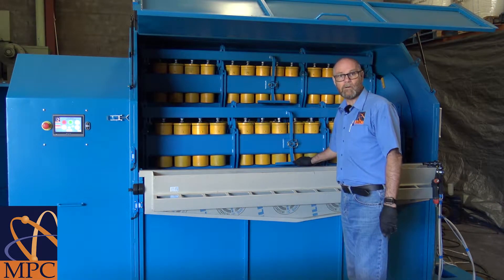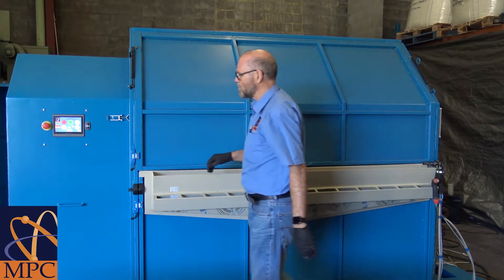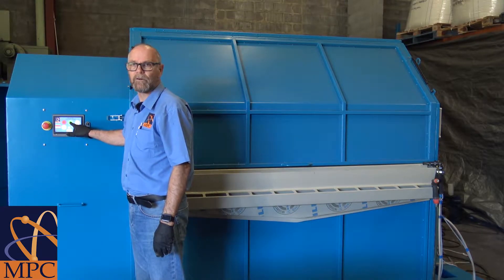After loading all four arms, we close the top door, then move to the HMI panel and press the run button to start its programmed run time.